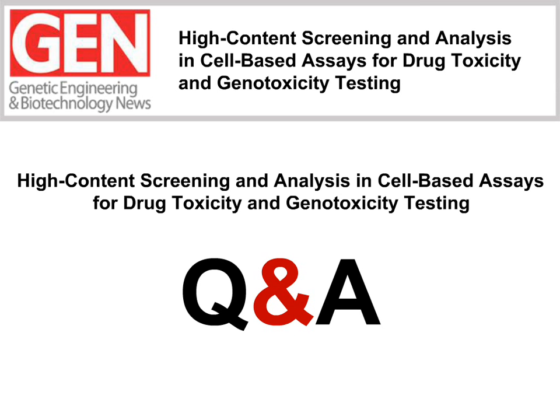All right, Heather, here's another one. Have you tried other parameters than those described, for example, texture or star morphology to identify toxic compounds? Okay, so these are assay aspects within the Operetta analysis protocol programs. We had a look at them. In terms of what we wanted to get out of this assay, we wanted it quite simplistic. These outputs were quite complex in terms of what we were getting out and interpreting them. So we decided we would keep it simple because it is basically an add-in to activity assays rather than a standalone toxicity assay.